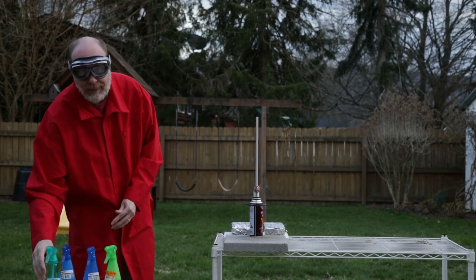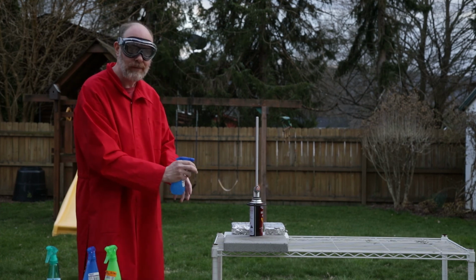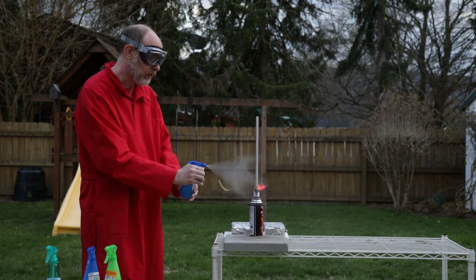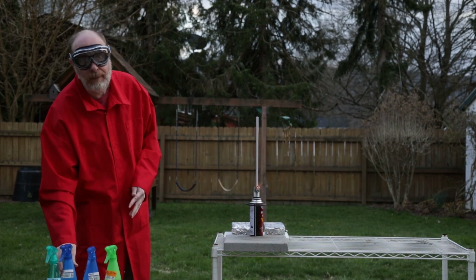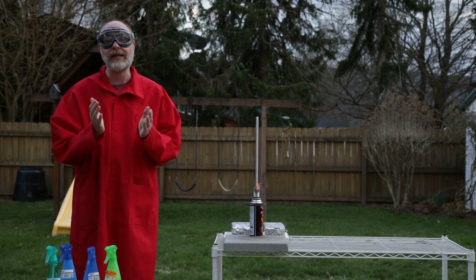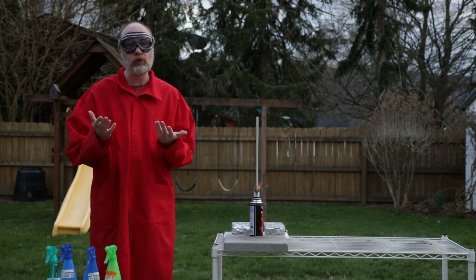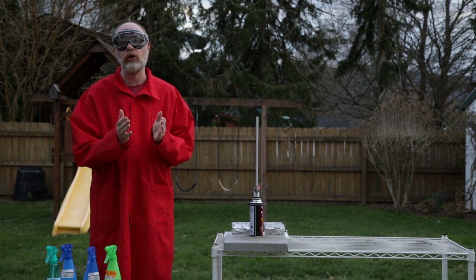And then strontium's even more intense. It's probably the most intense of the ions that we see, maybe close to what sodium provides, but provides a brilliant red color. And it just depends on what ion you use, what color you're going to end up getting. So that's the multicolor flame. So for now, we'll be done, and next week we're going to look at another type of flame experiment. We're going to look at the whoosh bottle.